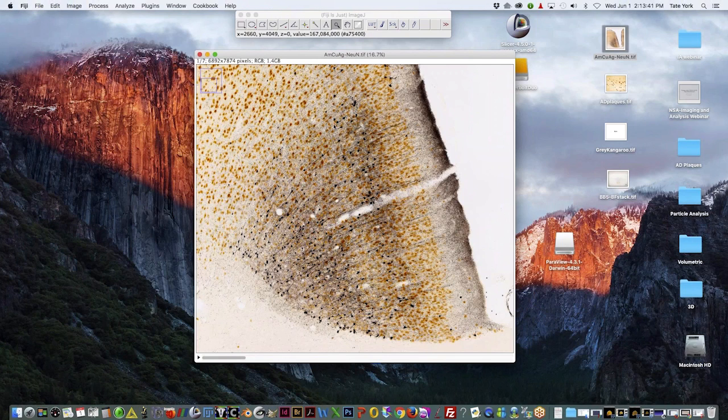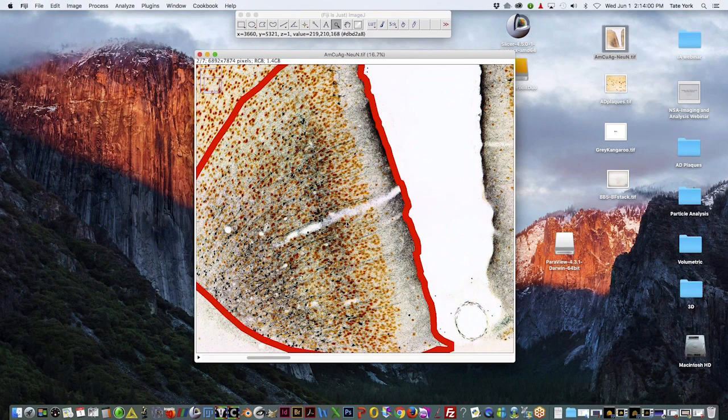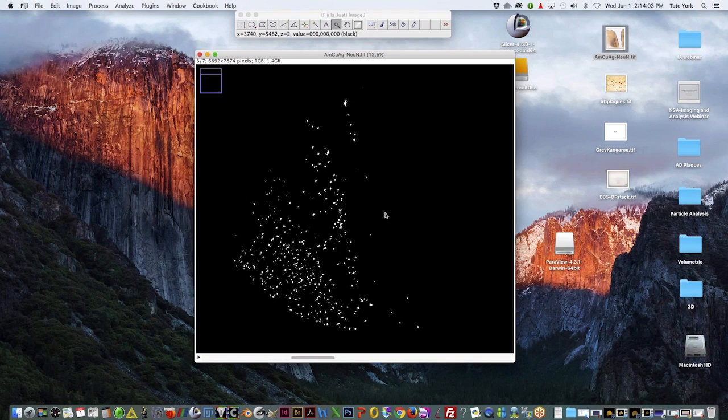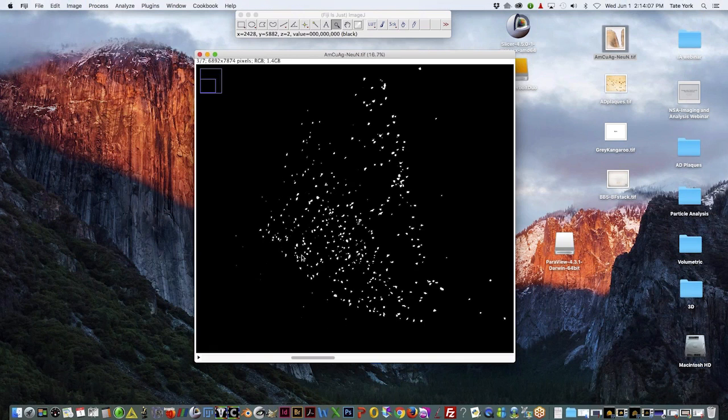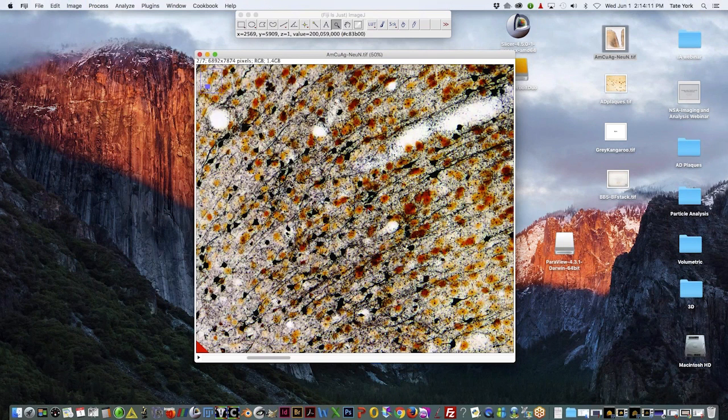So this is a binary image of the degenerating neurons. So after thresholding, filters were applied, and this one I believe doesn't have the watershed filter applied. And what that is, it's a filter that separates close proximity neurons that are touching. It'll go in and separate those that are touching based on the parameters that you input into the filter.